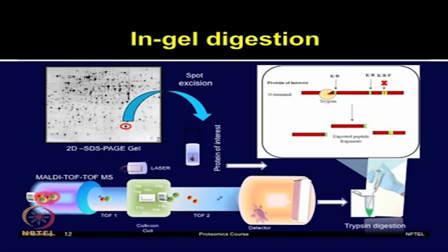Now, although this overview shows the process starting with the 2D gel, the same can also be applied for gel free proteomic techniques.